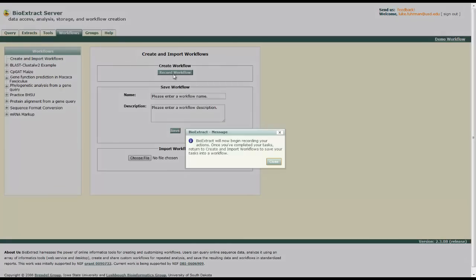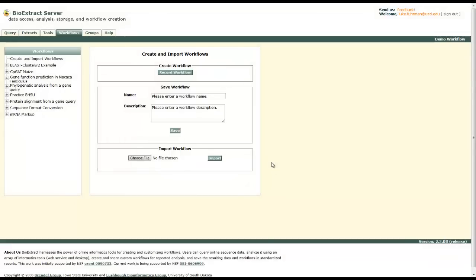You can share them as a group. Just click record workflow. And now everything that you do from here on until you hit save will be recorded.